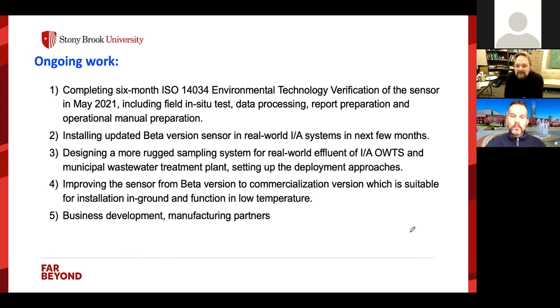But that's a big challenge because the current version is designed for wastewater. In wastewater, the concentration of nitrate is high, generally above 2 milligrams per liter. But for tap water or fresh water, it's less than this value. We need to think about a different protocol to measure such low, micromolar levels of nitrate and nitrite. Great. Thank you.